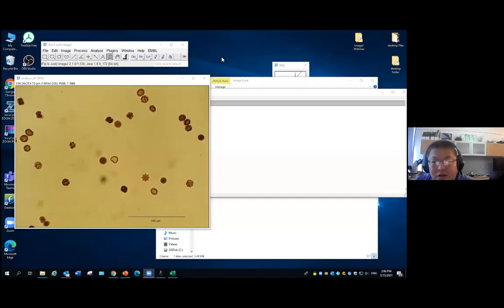What I'm asking is, we can define what the pixel width is from the scale. Can we do vice versa, like you want to add a scale bar? Like using the Zeiss program where you can add the scale bar, can we do that in ImageJ?